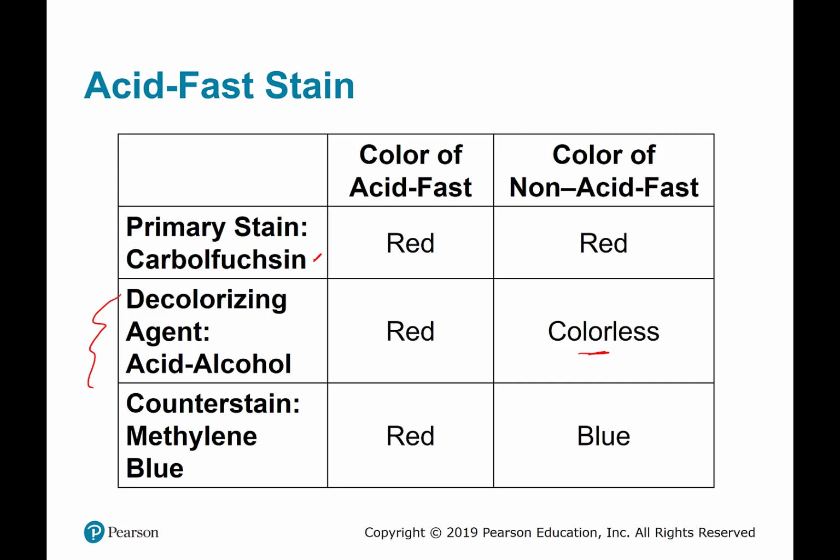So you then apply your counter stain, methylene blue. It is not going to penetrate that waxy outer layer, but it will penetrate the cells that are non-acid-fast. So if the bacterium is non-acid-fast, they are going to appear blue. If the bacterium is acid-fast, they will appear red.